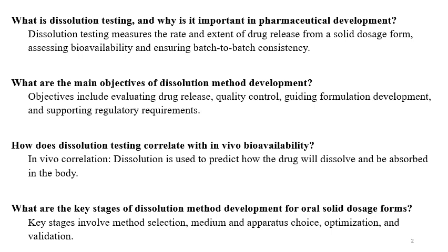What is dissolution testing? Why is it important in pharmaceutical development? Dissolution testing measures the rate and extent of drug release from the solid dosage form, and also for some of the liquid dosage forms like suspensions, assessing bioavailability and ensuring batch-to-batch consistency. Dissolution is also a test to release the batch into the market.